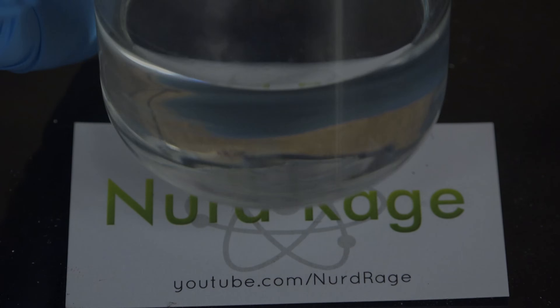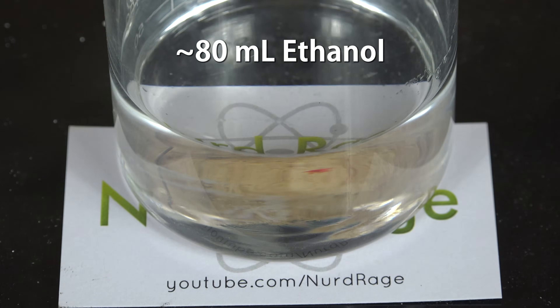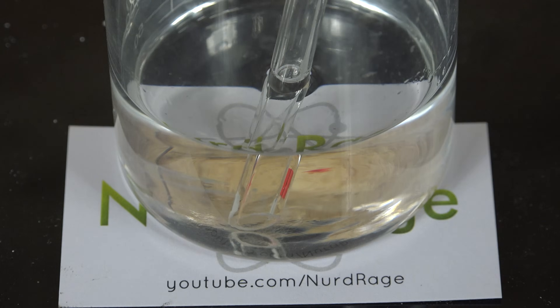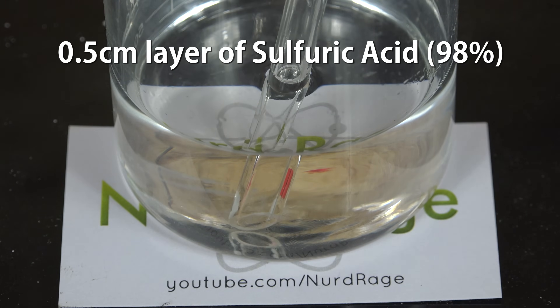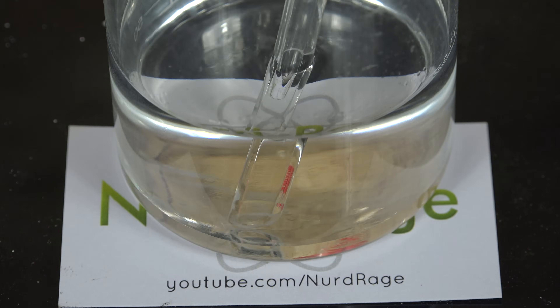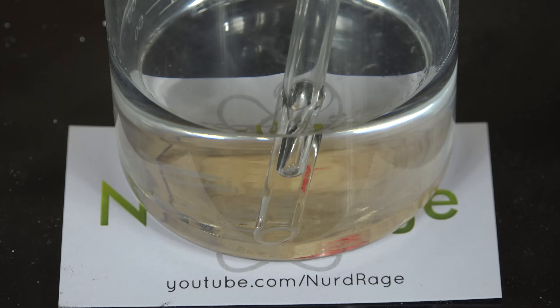To perform the experiment, we first get about 80mL or so of ethanol in a 250mL beaker. Now we put a glass funnel all the way to the bottom and carefully pour in 98% sulfuric acid until we form a layer about half a centimeter or quarter inch. We need the layer to remain distinct from the ethanol, and the funnel helps to prevent the layer of sulfuric acid from mixing.